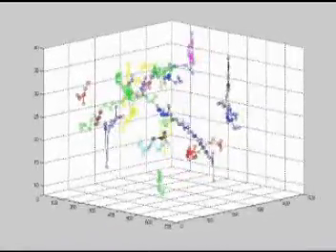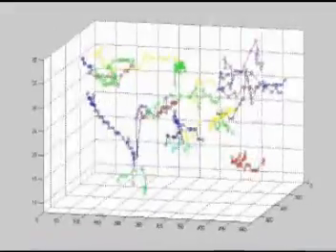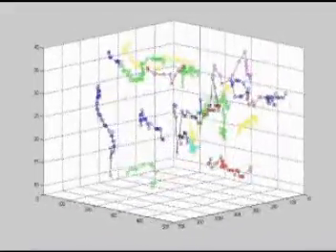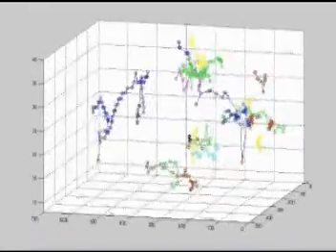The stereo pairs are digitized and analyzed by a computer program that calculates their locations and displays their trajectories in this three-dimensional plot.